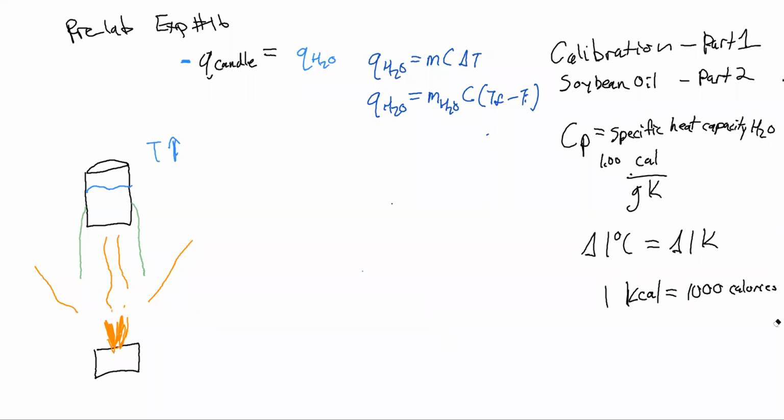Now, the heat of our water is going to come from our candle here. Right? So the heat is what we're releasing over on this side. Right, so this is our heat produced. And so if we don't lose too much to the air, then it should be equal to what we make from the candle, just a negative value.